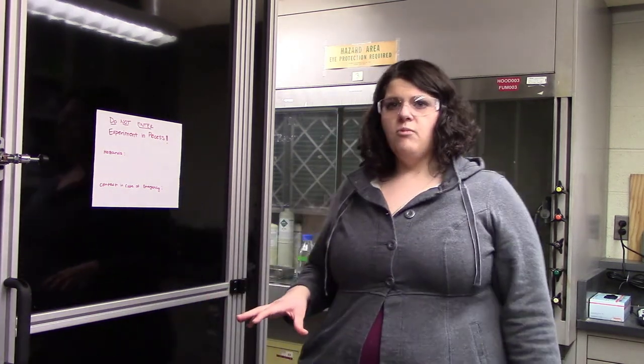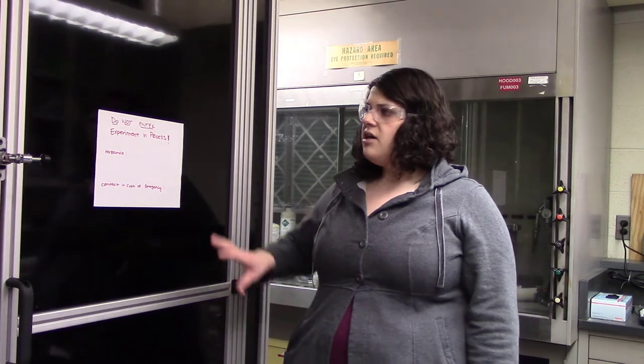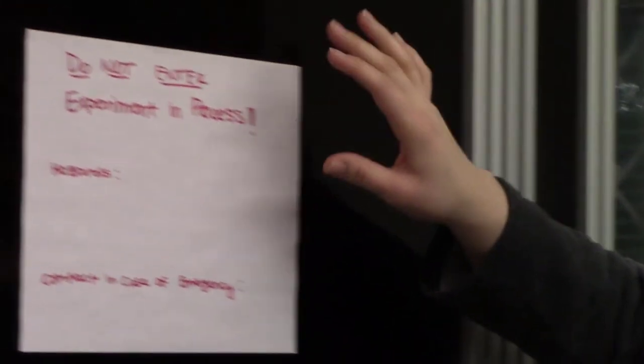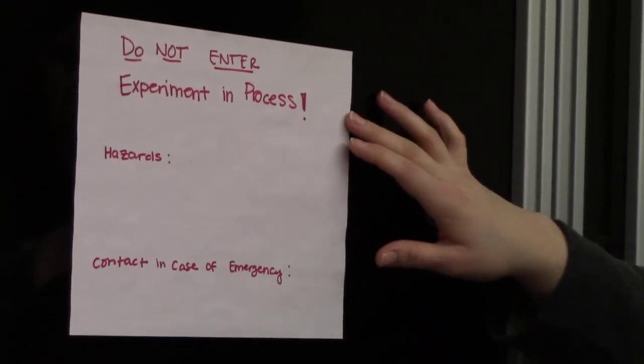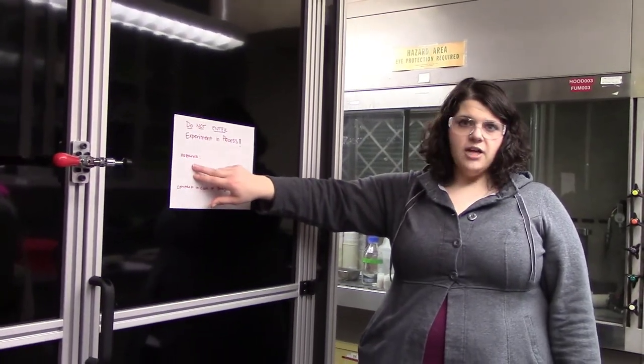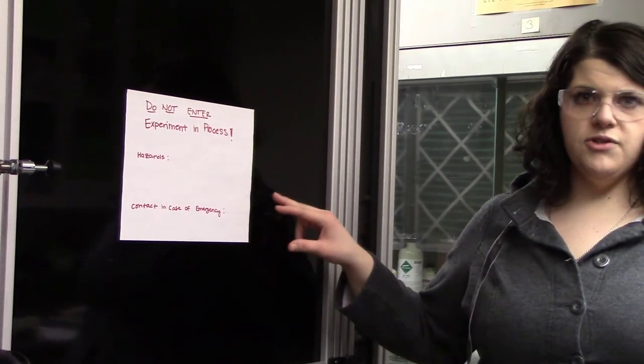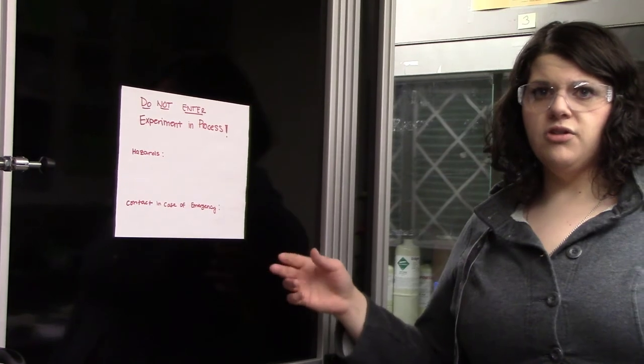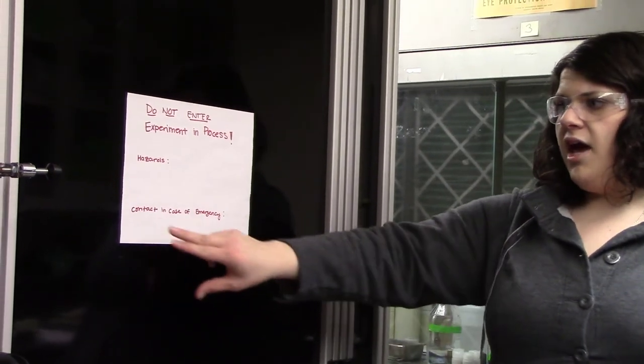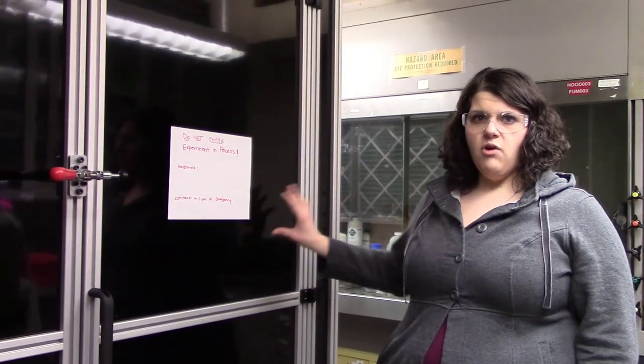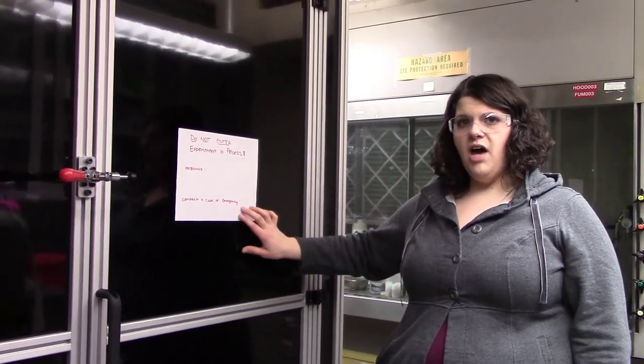Ways that we can keep other people safe that might not be working on the same project as us are we post signs on the door which tell people not to enter and also that there's an experiment going on. If there was an experiment actually going on, we would list our hazards that are inside the chamber, so what chemicals are we using, is there a shock hazard, is there a trip hazard, things like that. And then in case of an emergency, so if there was a chemical spill or a fire or somebody felt like something wasn't going right inside the chamber, they would have a contact number to get a hold of one of us.